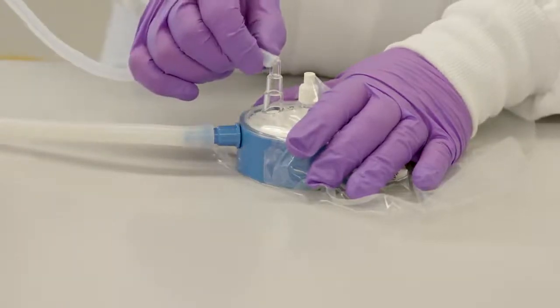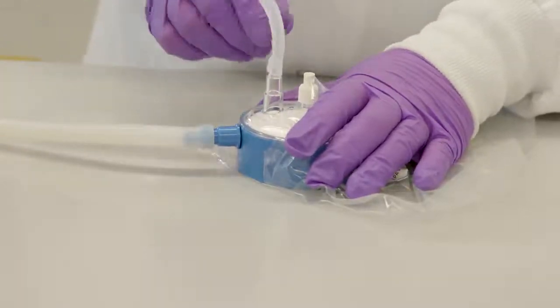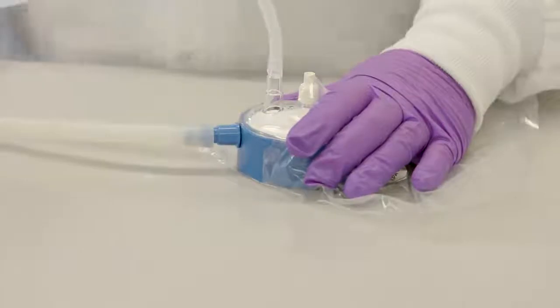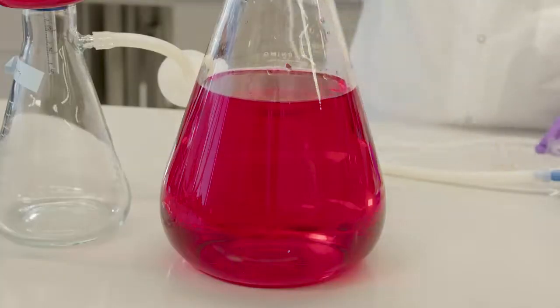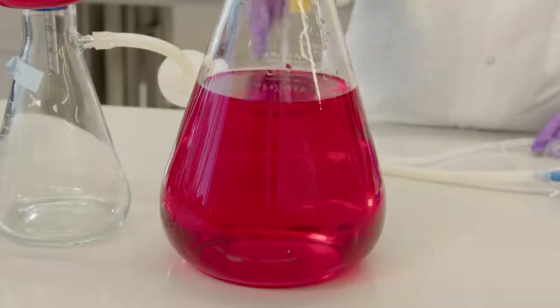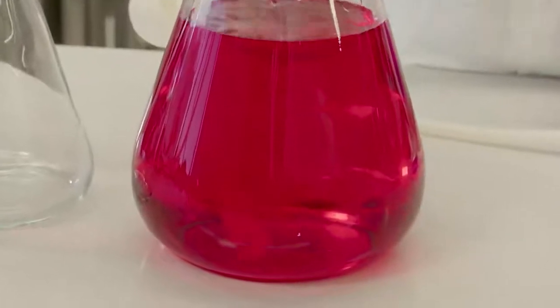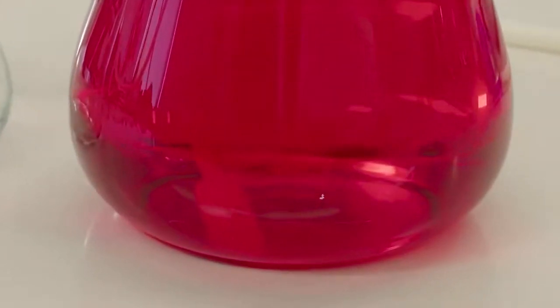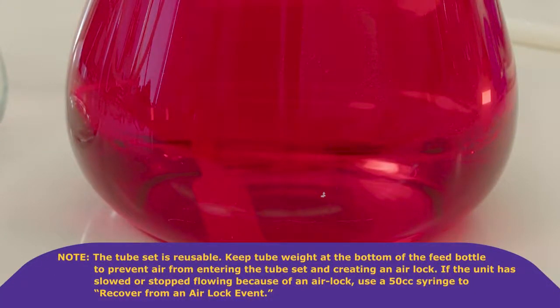Connect the feed tube to the barbed fitting marked inlet on the clear dome top of the device. Place the other end of the tube into the solution you want to filter with the tube weight at the bottom of the feeder container. The tube set is reusable. Keep the tube weight at the bottom of the feed bottle to prevent air from entering the tube set and creating an airlock.